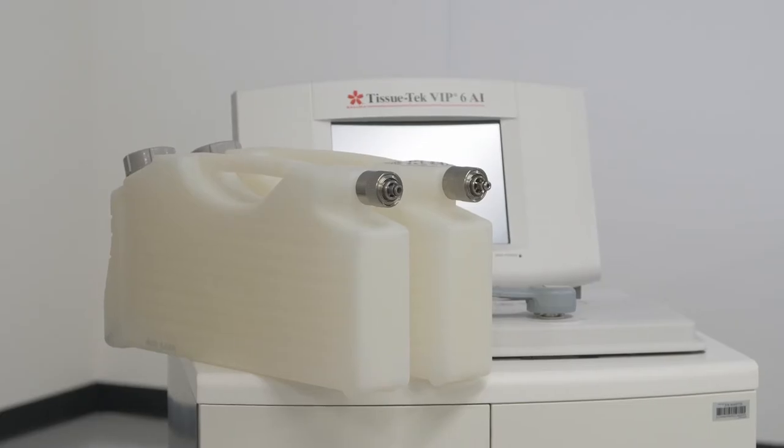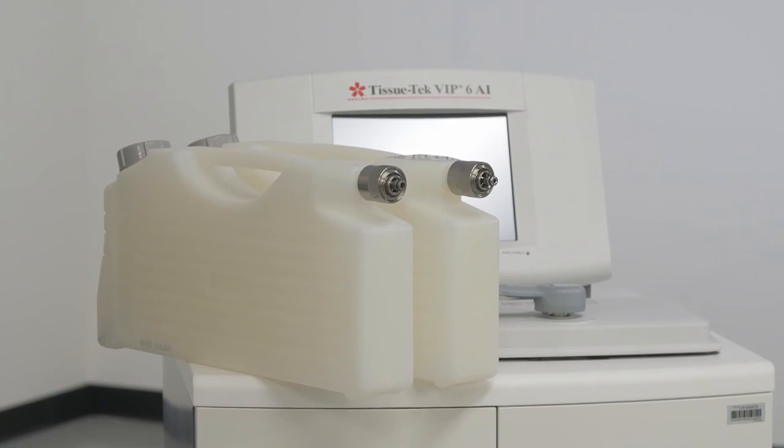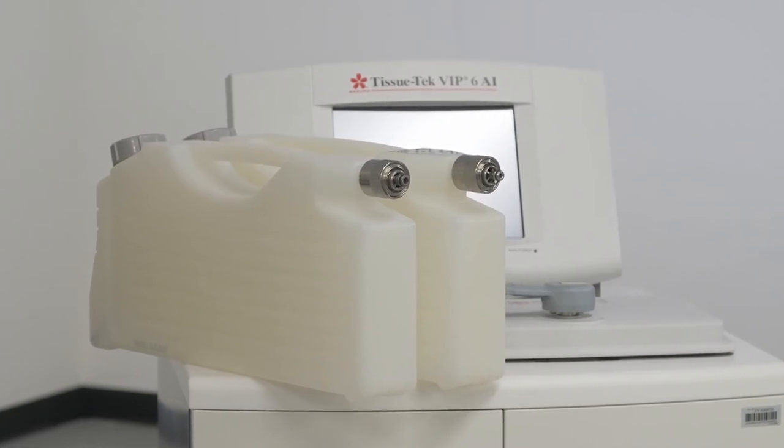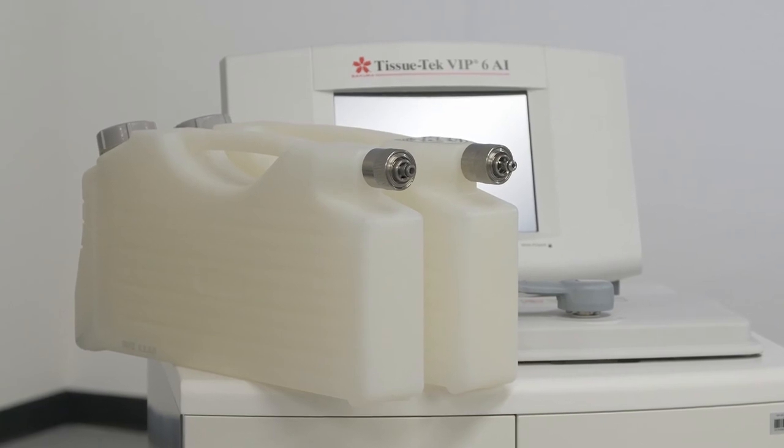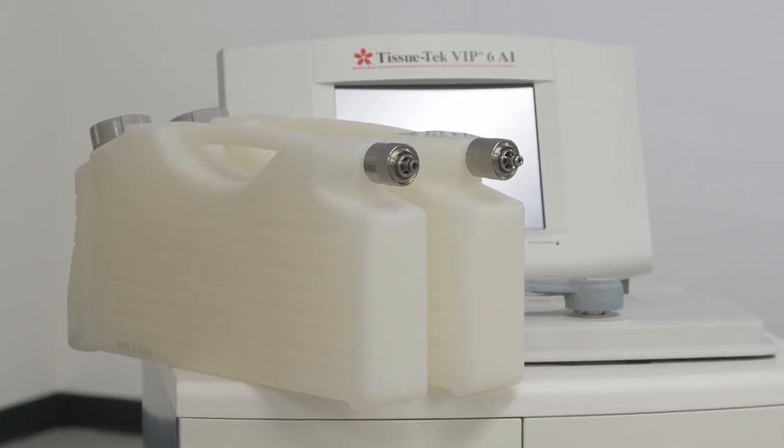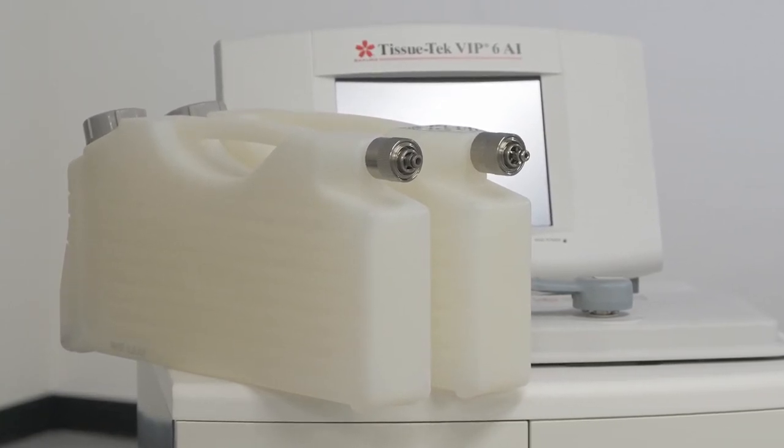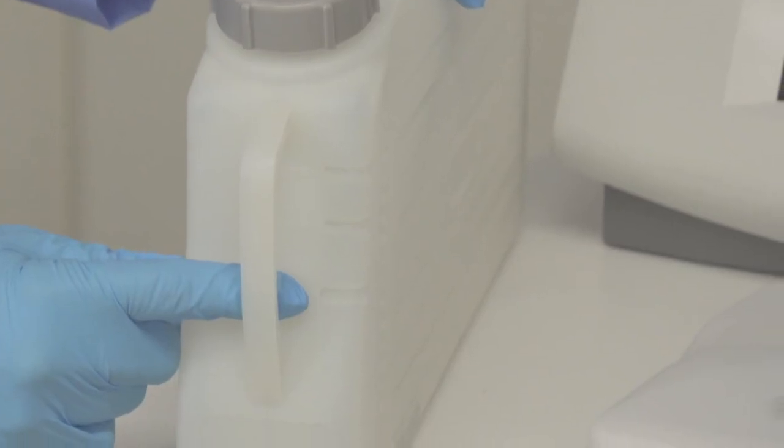The plastic bottles themselves are all the same. Our containers have several markings to help you fill with reagent. The sides of the containers are marked every 200 milliliters. The front of the containers have three level markings to make it easier to visualize when placed inside the processor.